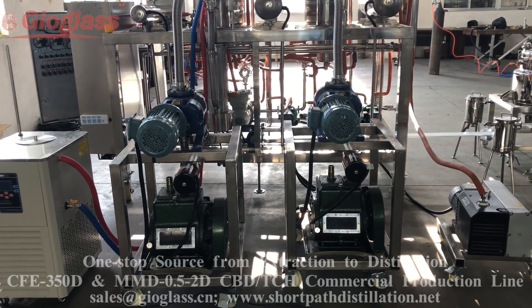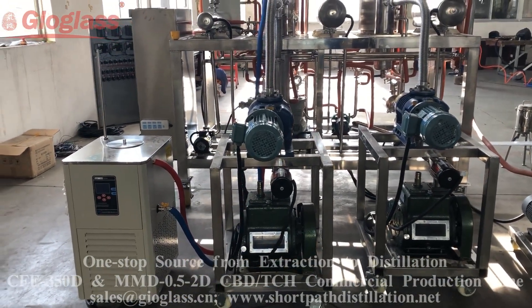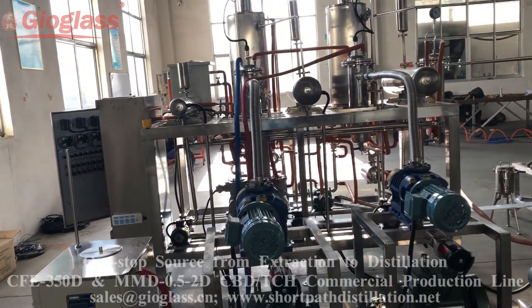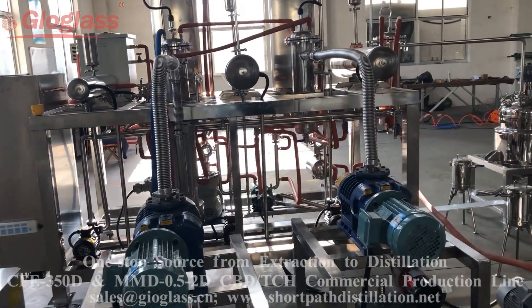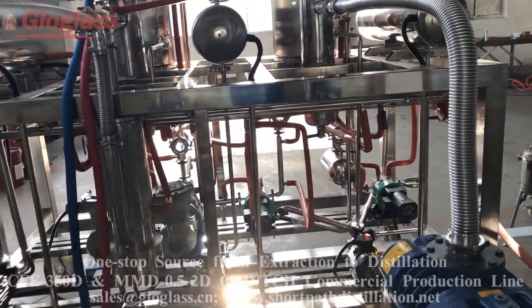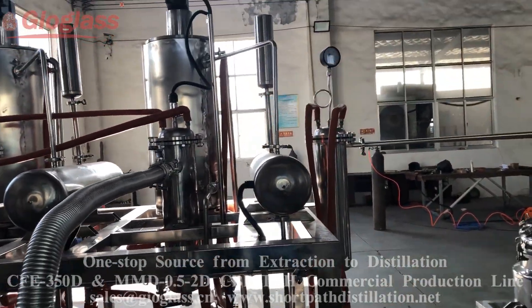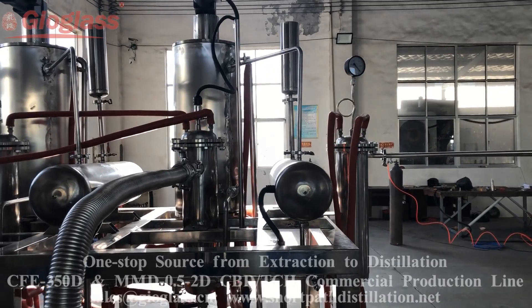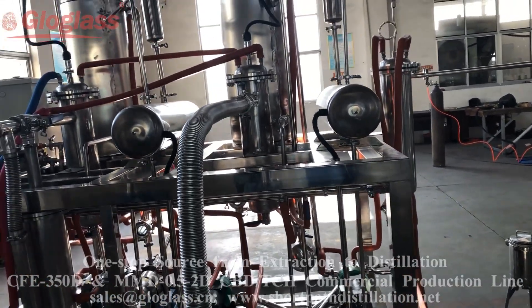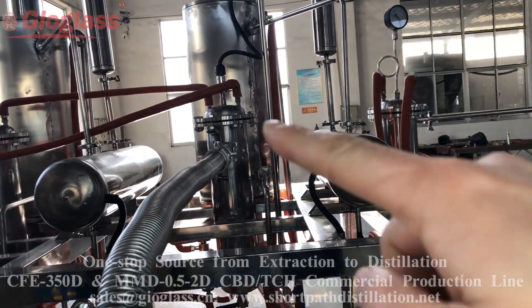This is the chiller for the condenser. You can see the heater here, and this is the condenser.